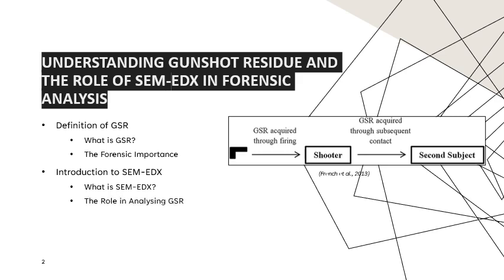So, the role in analyzing GSR, gunshot residue. SEM EDX provides a powerful means of identifying gunshot residue particles based on their unique shape and elemental composition. It can detect specific elements such as lead, barium, and antimony, which are indicative of gunshot residue.